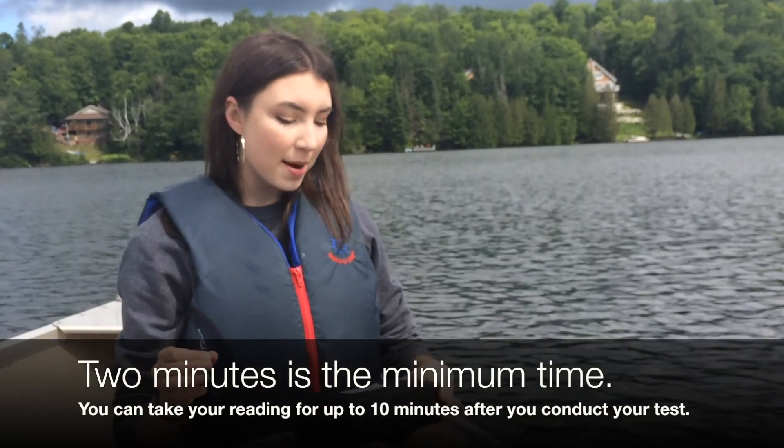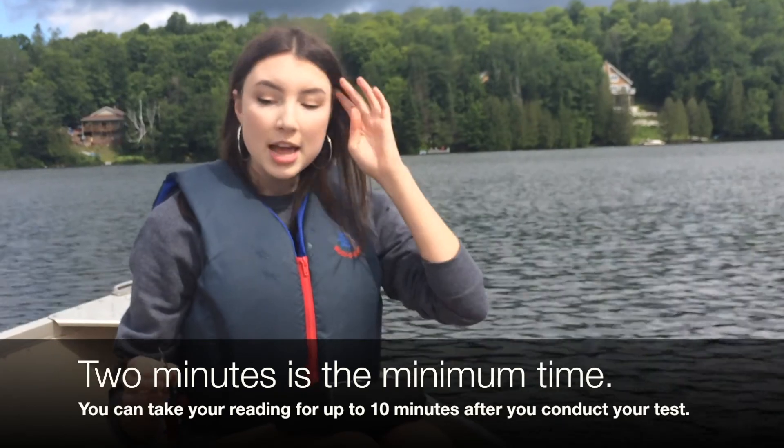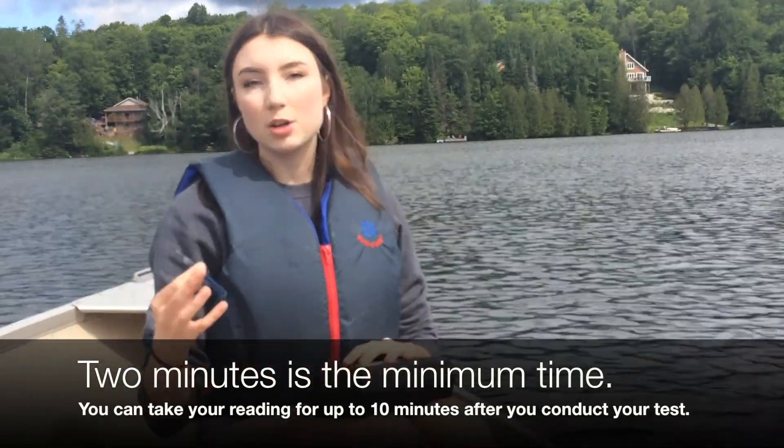The two minutes are now up. If you don't have a timer in your kit, you're also able to use your phone — anything that will time the two minutes — and that also makes it easier when you have two people.